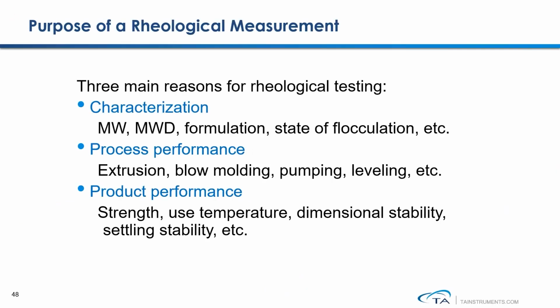In polymer industries, rheology technique is commonly used for 3 major purposes. First, the rheological testing results can be used to quantitatively compare and evaluate the polymer chain's molecular weight distribution, and also compare polymers which contain different amounts of long chain branching structure.